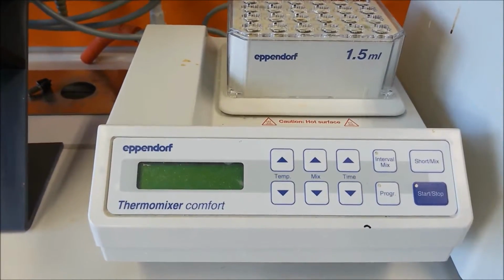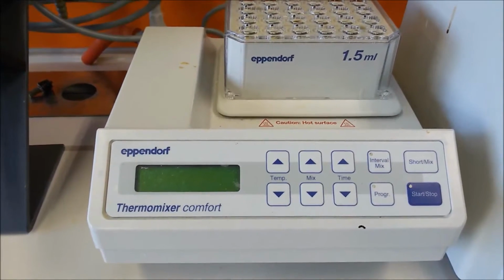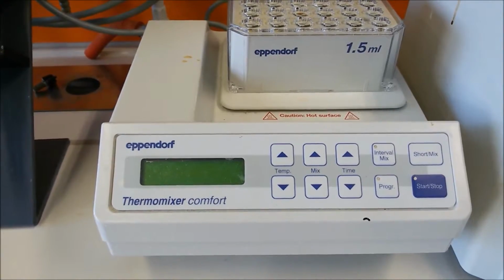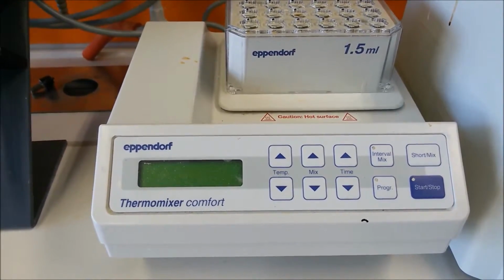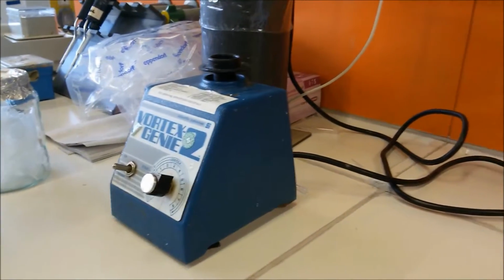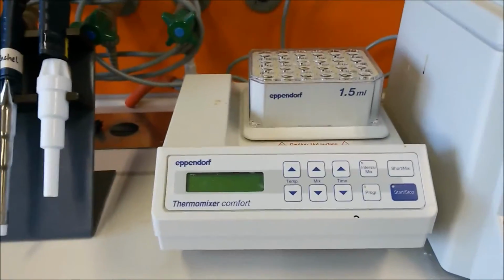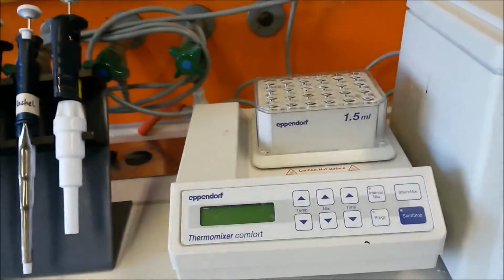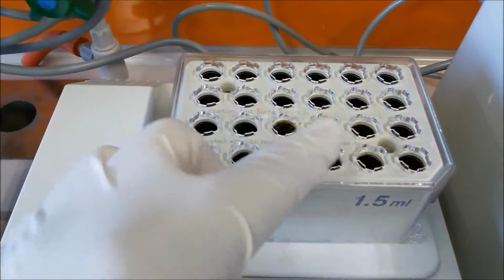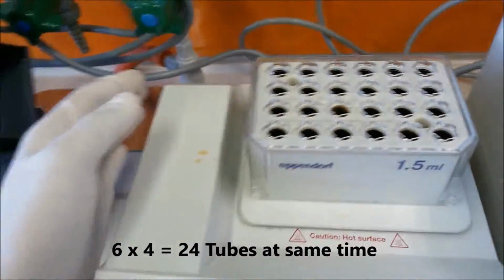Again, it belongs to Eppendorf. Yes, so we call this instrument a Thermo Mixer, because it also does the mixing, but here you can regulate the temperature. So this is a normal mixer, no temperature. You can do it at room temperature, manual with hand. And this one you can use, you can actually put 1, 2, 3, 4, 5, 6, 24 tubes at the same time.